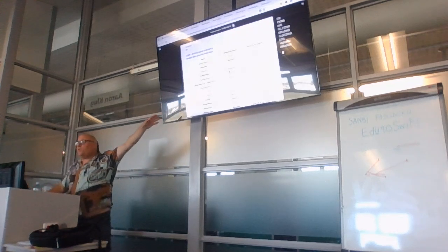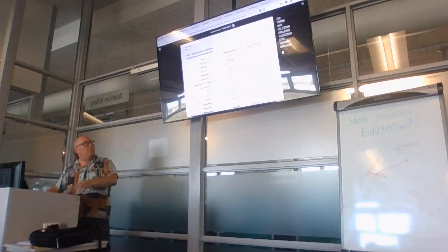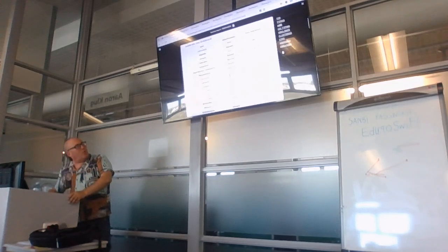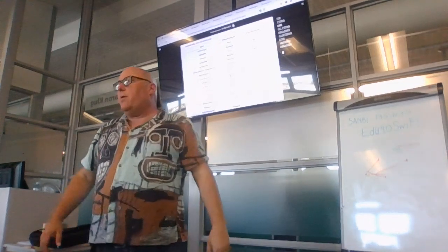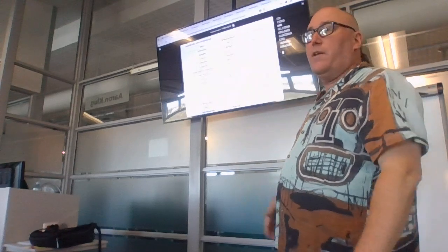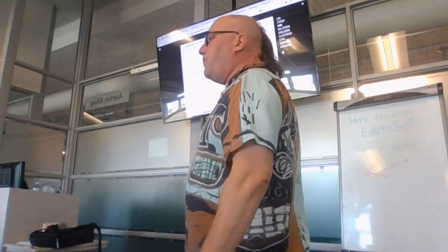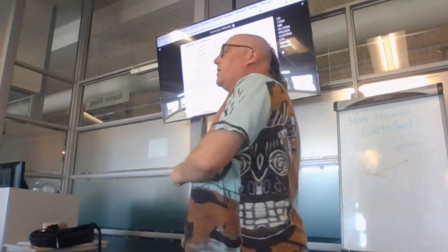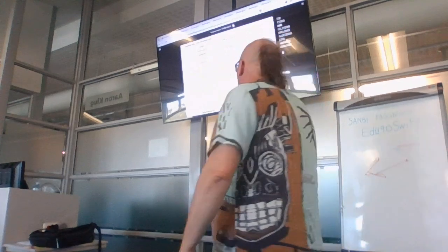It does a scan of some commonly known antibiotic resistance types in Vibrio cholerae, and one of the things I quite like about this is that I can do the same report using Galaxy, or on the command line using, say, AMRFinderPlus or something like that. But what I like about what the Pathogen Watch team has done is that they've also taken some of the single nucleotide variants.